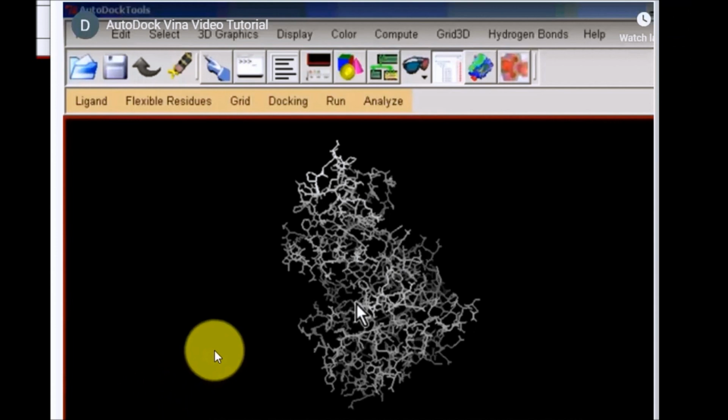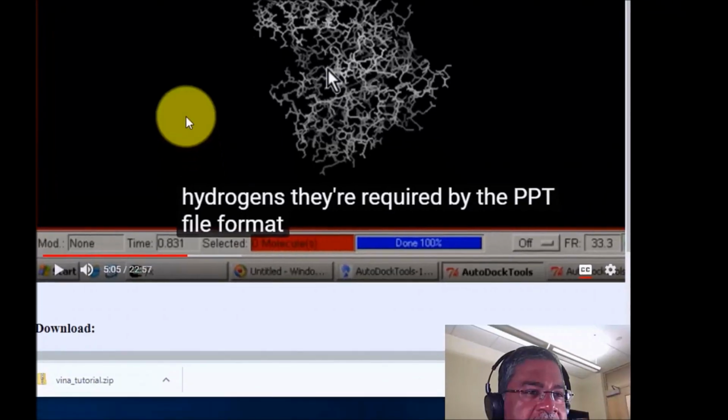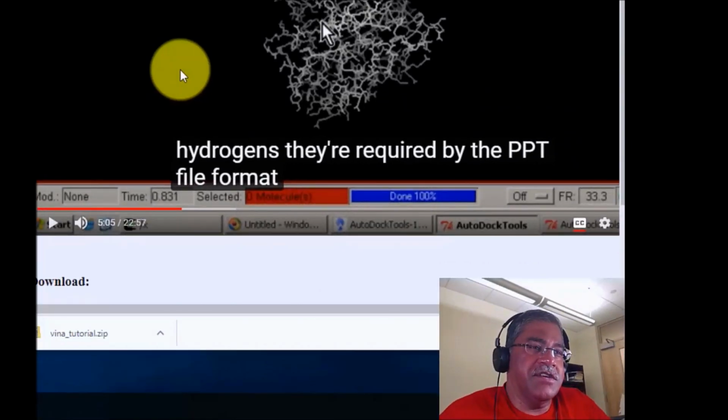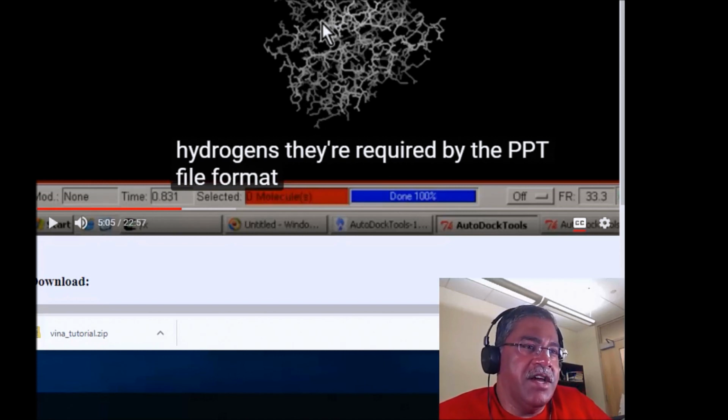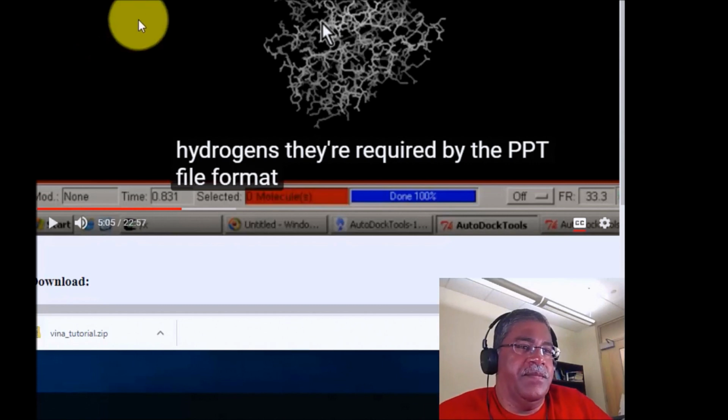The way this video is rendering, it doesn't look like you can see many of the hydrogen atoms, right? The black and white is obviously an older version. The version that we are looking at here is a newer version, and so you can tell that the hydrogens have been added. It's a lot more stark.